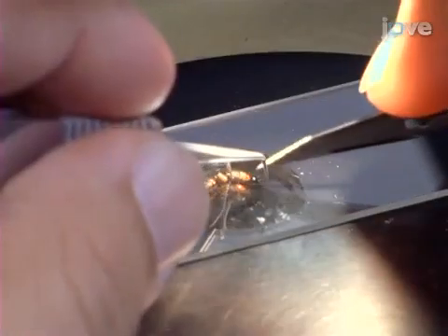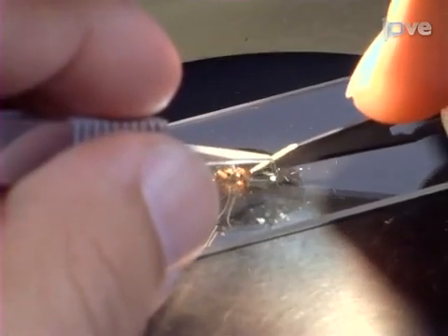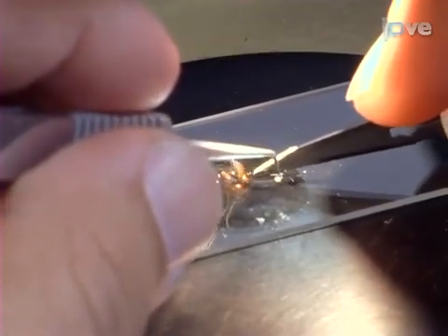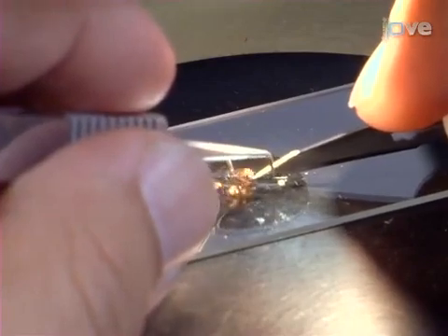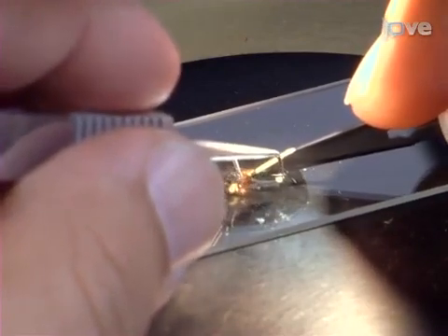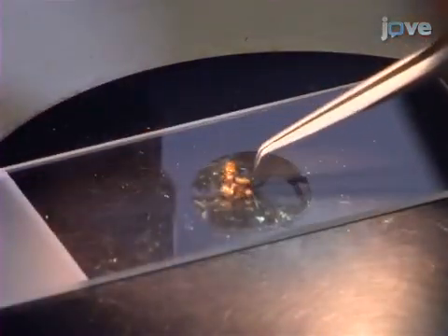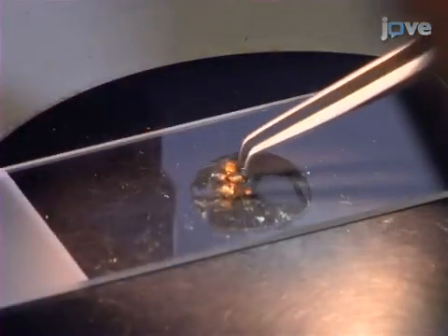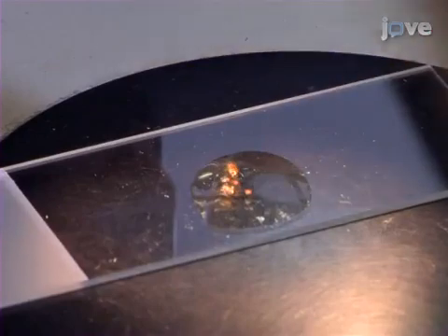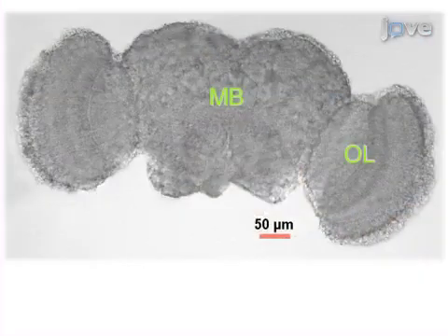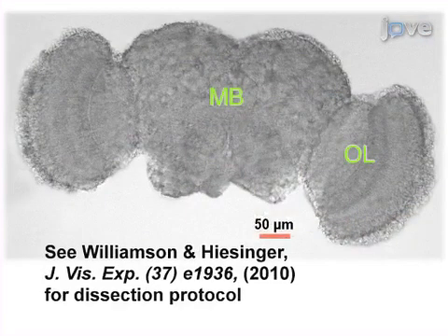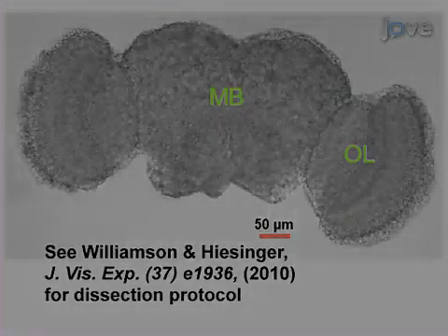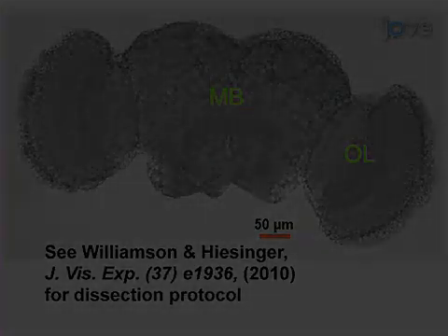Then decapitate the fly heads under a dissection microscope, avoiding desiccation. Discard the fly bodies. Now extract the full brain, carefully removing cuticle particulates and any non-brain tissue, like the eye pigment tissue.